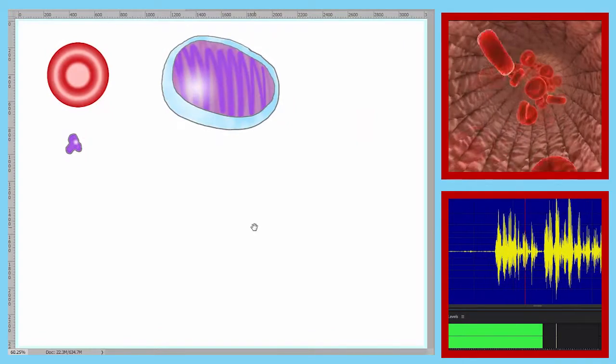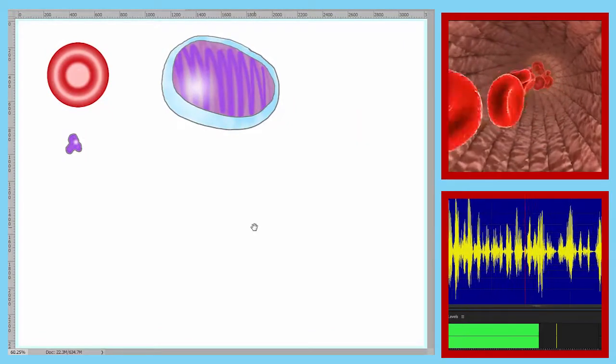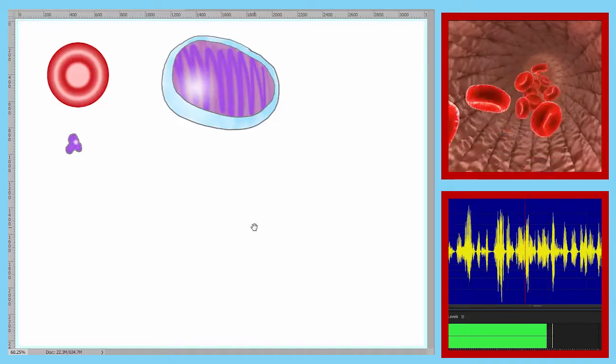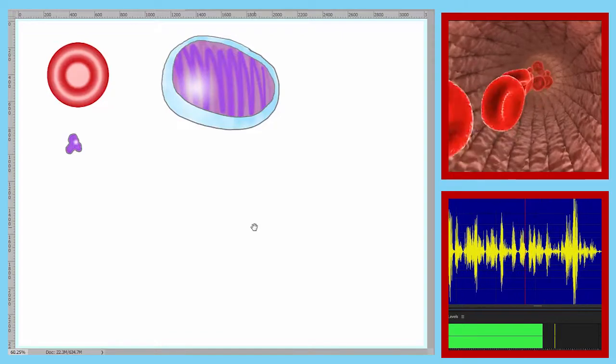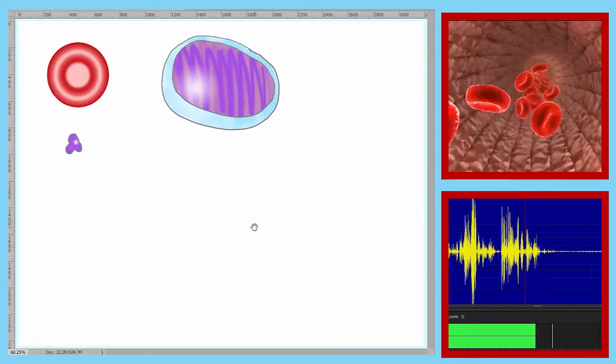Shown here is our next formed element. This is a relatively large cell compared to our red disc. It has a clear blue cytoplasm and a large nucleus. And the cytoplasm can only be seen at the rim of the cell, a very thin, very small cytoplasm. So this is our second formed element. Let's look at our next formed element.